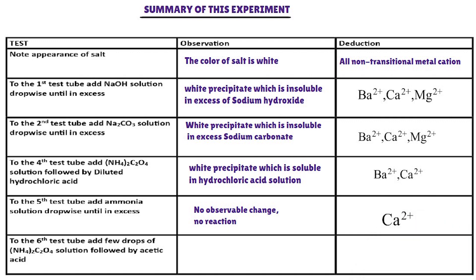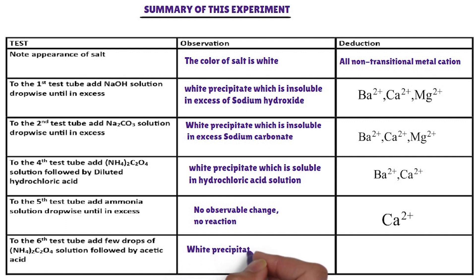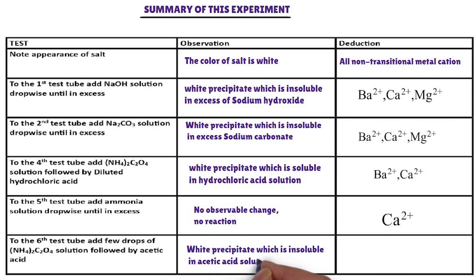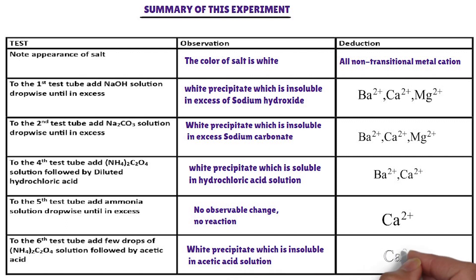Confirmatory test. In the fifth test tube, ammonium oxalate solution followed by acetic acid is added. The cation from the above list that forms a white precipitate with ammonium oxalate solution, and the precipitate is insoluble in acetic acid, is calcium ion. Calcium ion is confirmed. The cation present in the salt is calcium ion.